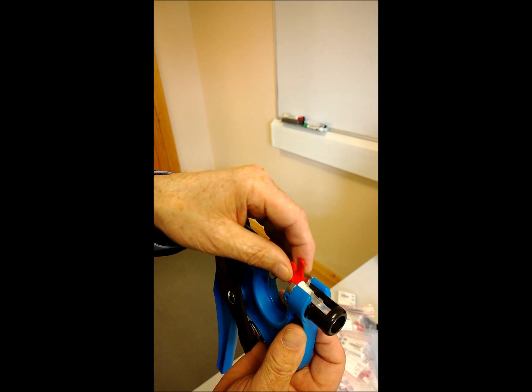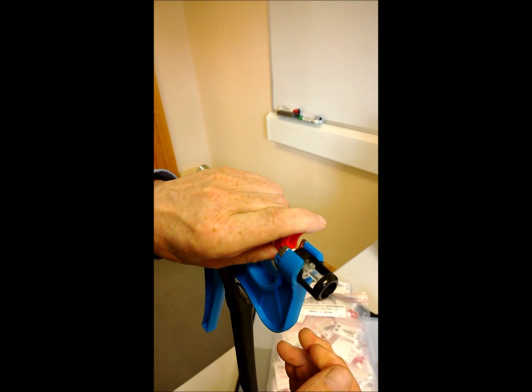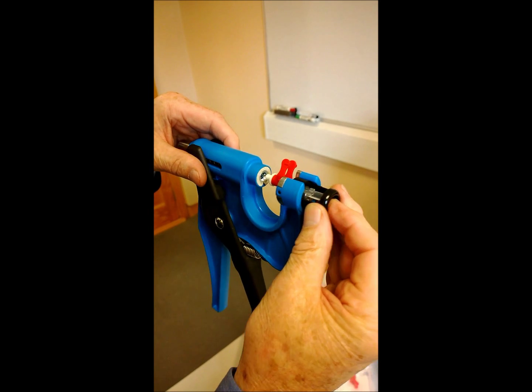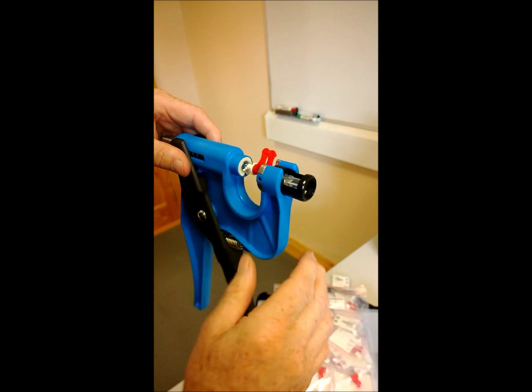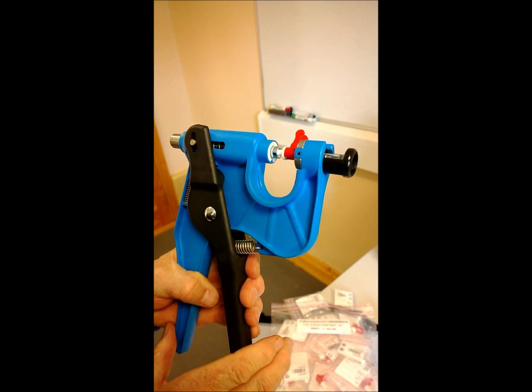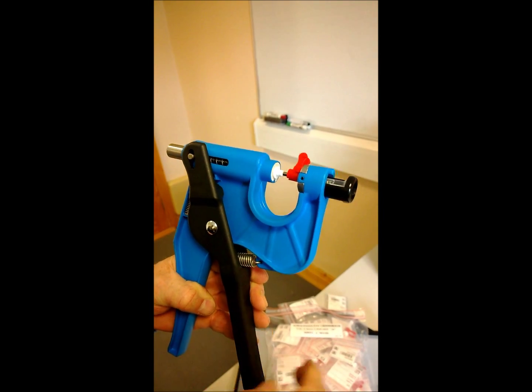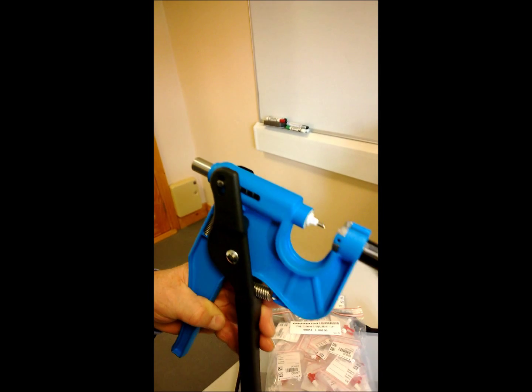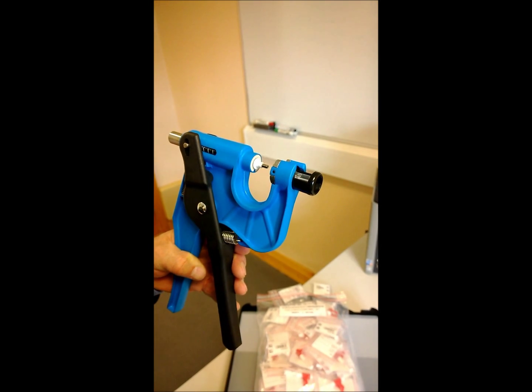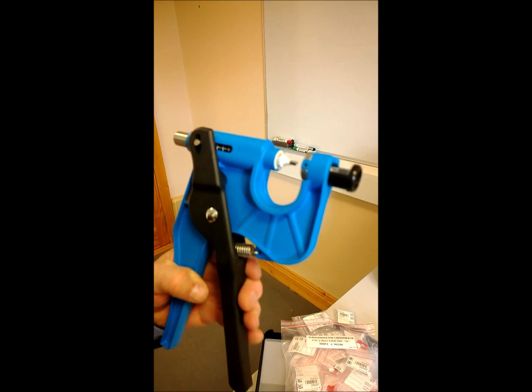Seat the tube into the cavity and turn the black handle until the tube is sealed in. Then what we call priming the tube - just press forward. Then remove the red piece, which is waste; it's not needed anymore, it has done its job. We're now in a position to tag the animal.